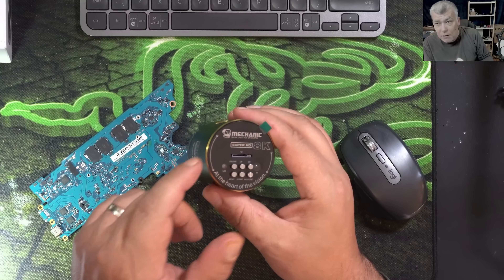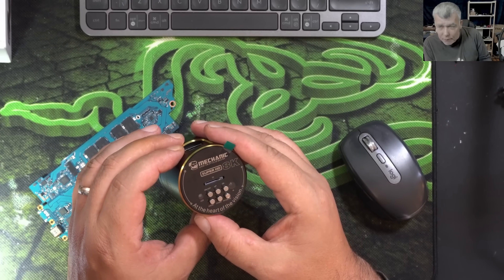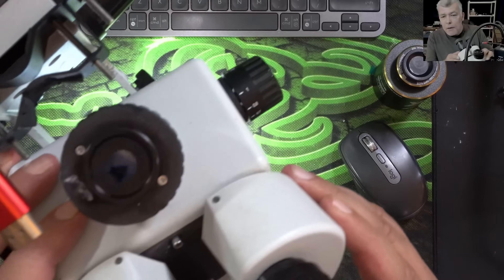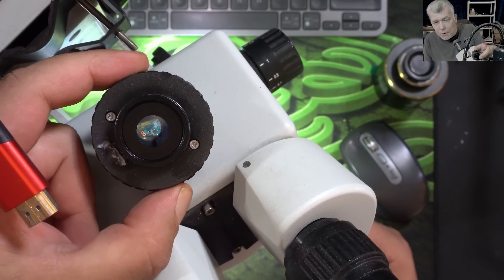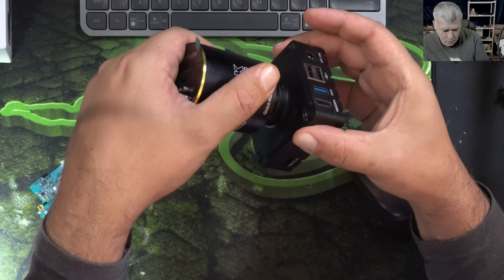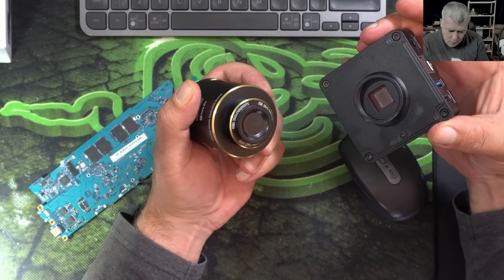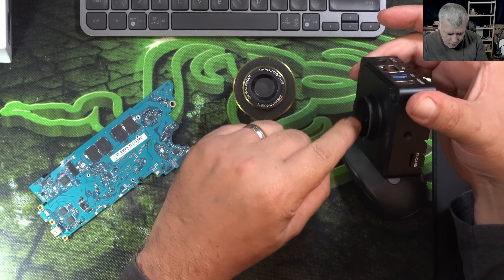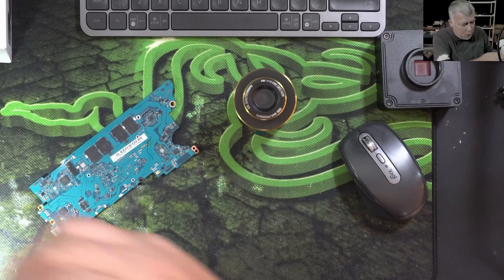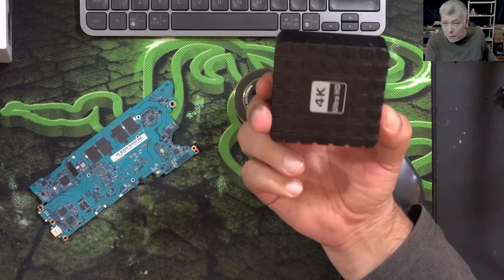Mechanic didn't disappoint — the camera was too cheap to seem true, but Mechanic always delivers good quality stuff. The C-mount situation confused me: I thought this was C-mount but it isn't compatible with my setup. My current camera has a focus ring with threads; this one has a focus ring too — they're nearly the same — but this one doesn't have threads. Let me know where I can buy the right mount so I can swap this camera onto my microscope.